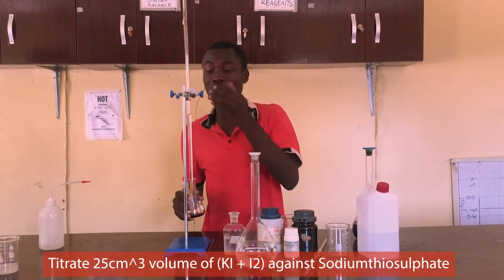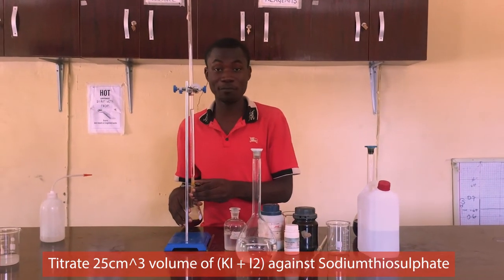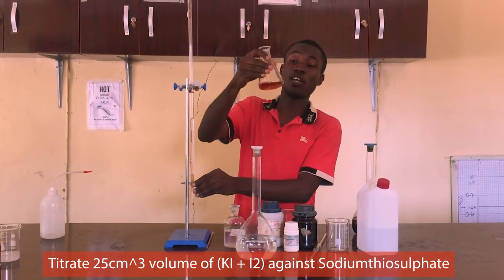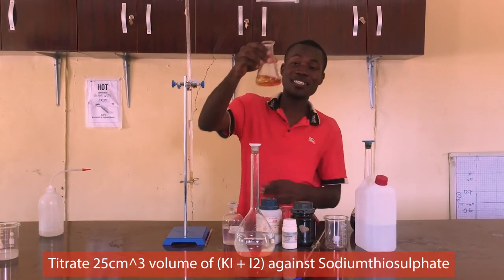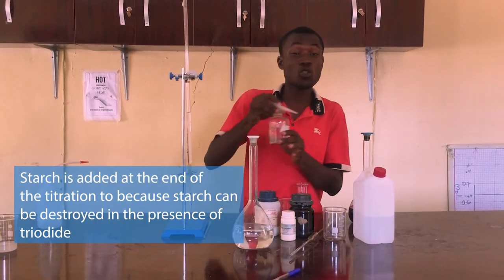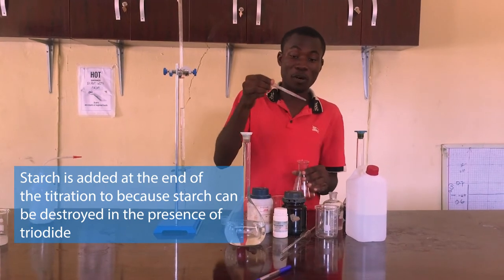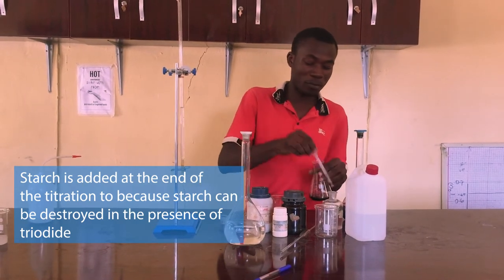The titration is going to be thiosulfate against the triiodide ion, and we are just going to do it gradually until the color becomes lighter. You can see it is now yellow. You have your dropping pipette and your soluble starch that has been boiled — freshly prepared today. We are going to add some drops; you need about 5 ml in this particular reaction. When you add some quantity into it, this is just for color development.